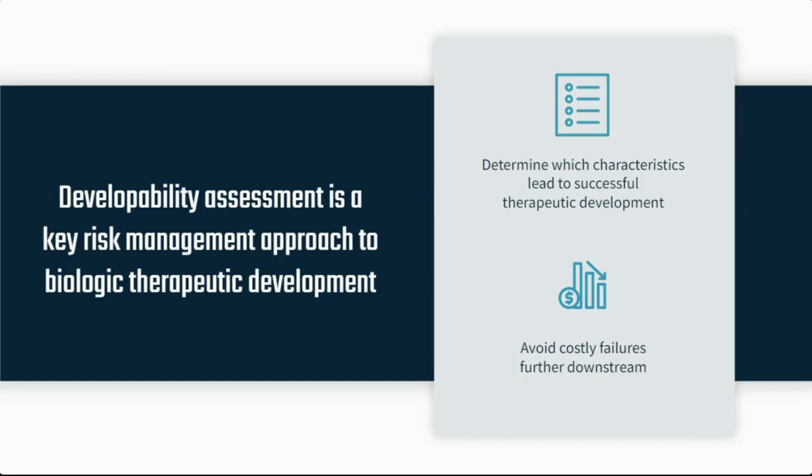So early on in your development and formulation process, typically you have very little sample to work with, and from that you need to learn a multitude of information. Whether you're screening different constructs or looking at different buffer conditions, it's critically important to ensure you understand as much about your sample prior to advancing it through your pipeline.